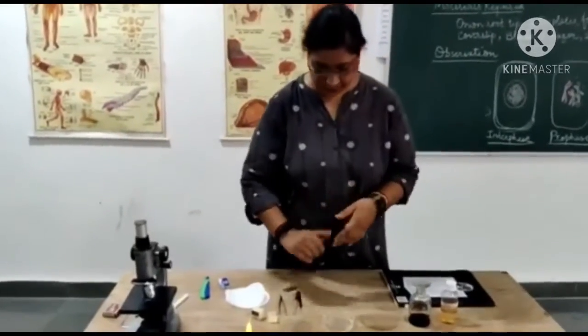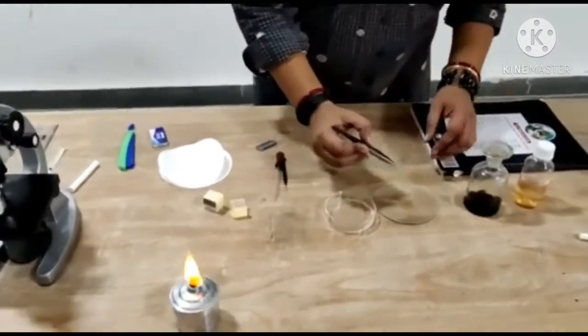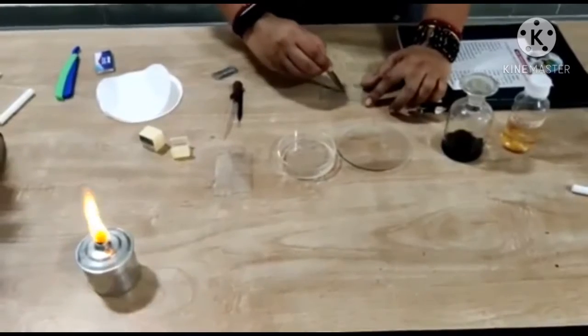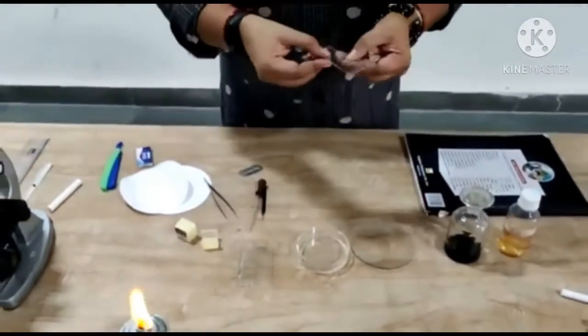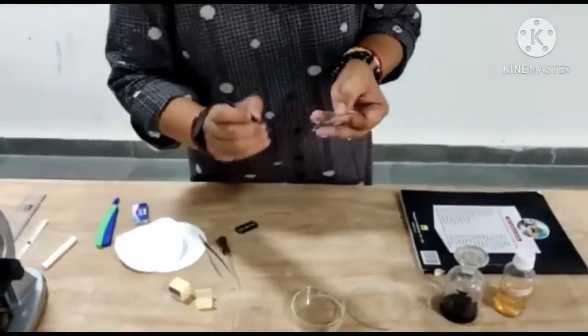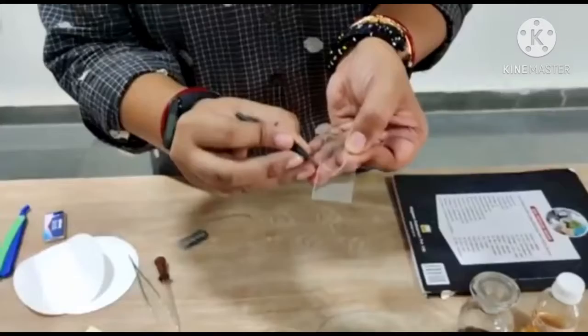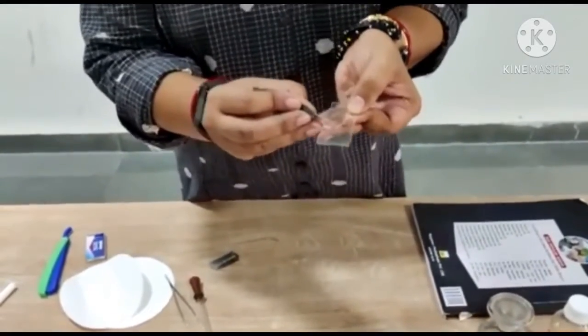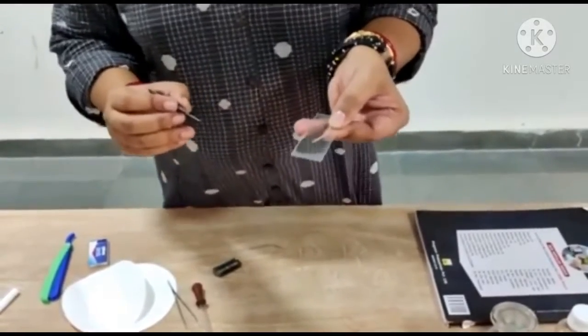Let us see the procedure. First of all, we take root tip of onion on the clean slide. In this slide, we can see there is the root cap portion. We have to remove the root cap portion and observe the tip portion, which is the meristematic zone. In this meristematic zone, the cells are in continuous state of division.